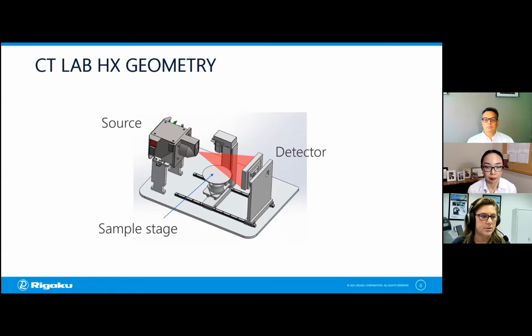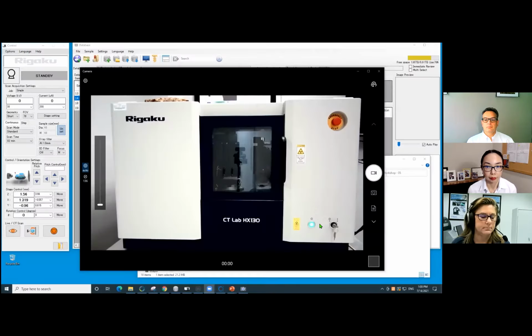So I'm going to change the share to this screen. Just confirm you see it. Yep, here it is. So this is our CT Lab HX system.